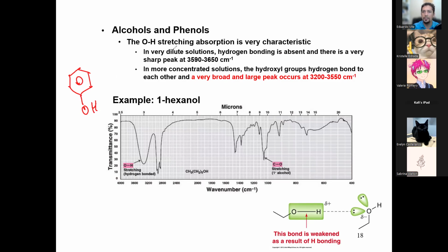So in general, it's the OH bond that we're looking at in these stretches, right? That OH bond is the characteristic one that we are looking for. So how do we see it? Where is it at? What does it look like? I'm going to use pink. You see here at 3300, we have a broad, strong signal. This is your OH stretch.